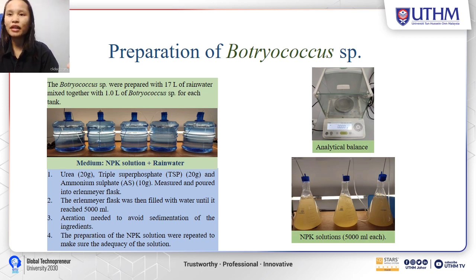Finally, the aeration is needed to avoid sedimentation of the ingredients. The preparation of the NPK solution will be repeated to make sure the adequacy of the solution. The analytical balance picture and the NPK solutions are in this slide.